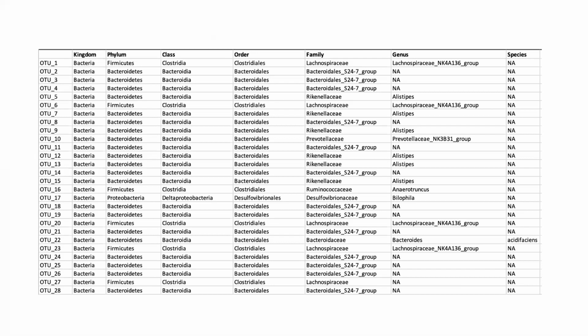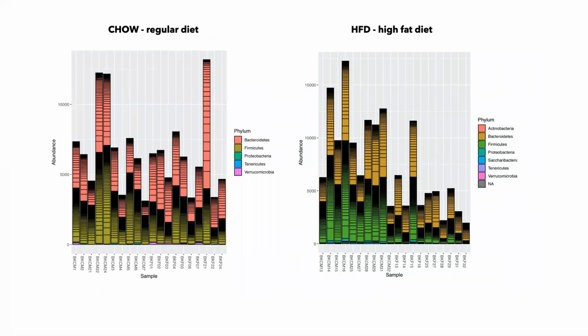And then, you now know what these basically mean, what we just produced together. It just produces a plot by abundance of each phyla, and also looks at how these phyla are different within each sample.